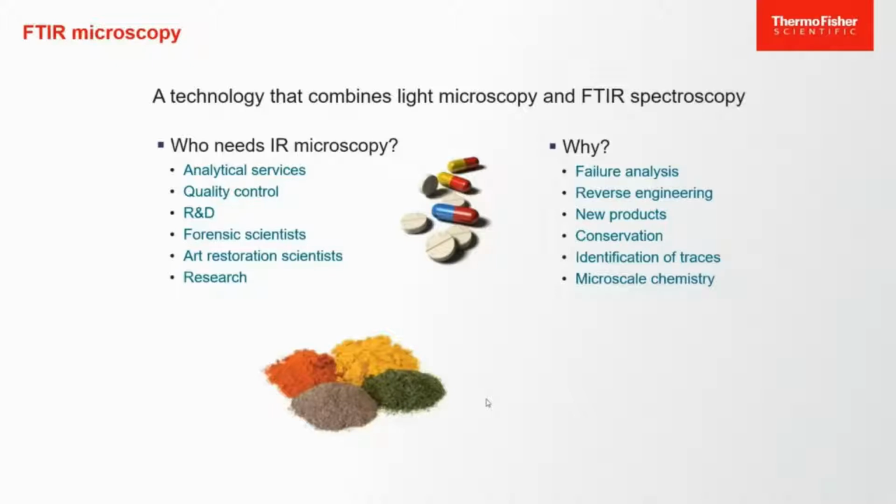So it may be as simple a question as I've got this fleck of some contaminant and I need to identify it, and it's just a tiny little piece, or it could be as complex as identifying the signature of various components in ancient paintings to identify whether or not they could be counterfeit or forgeries or the real deal. So there's a lot of uses for the FTIR microscopy, and I'm going to show you a few of those throughout the talk.